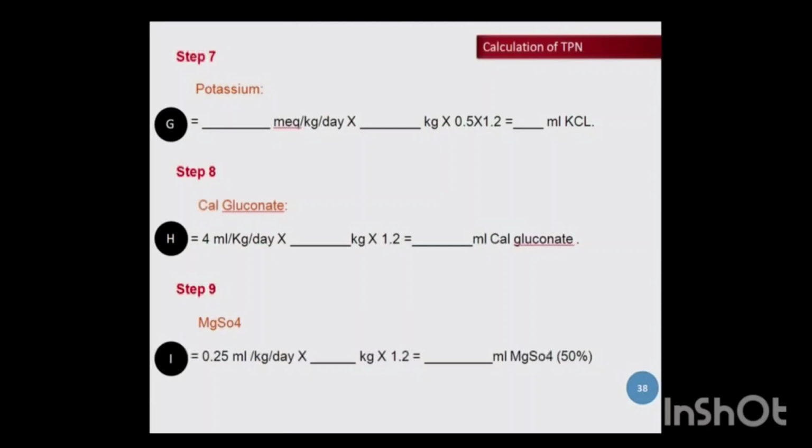If total parenteral nutrition is being infused through a peripheral line, one has to be extra cautious about extravasation if calcium gluconate is being used. There would be no such worries if a properly positioned central line is being used.